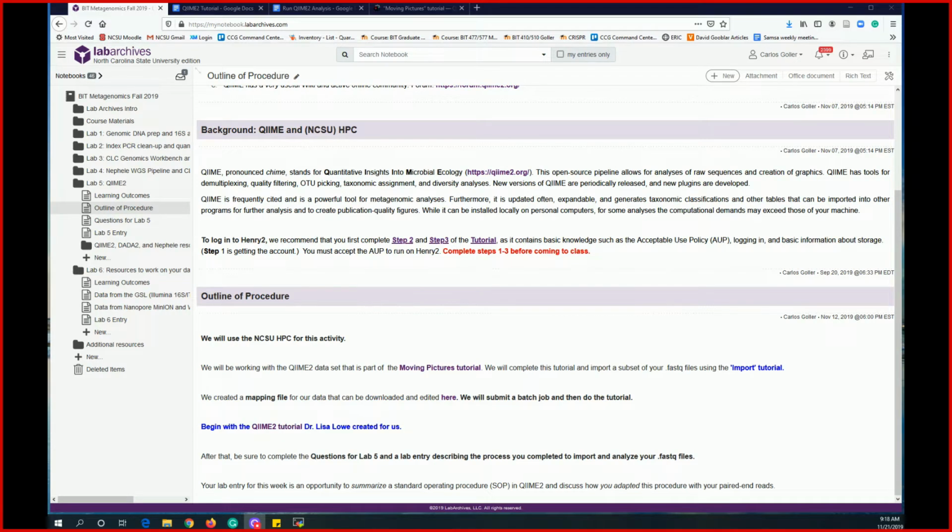Welcome. We are going to use the HPC to launch a QIIME 2 job.